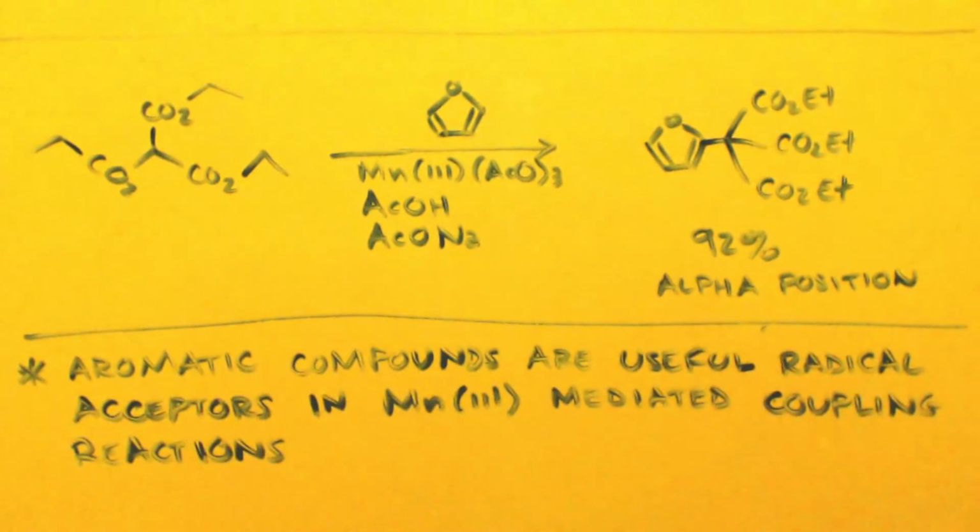So it works really well. You won't get that kind of yield with benzene and acetone, I think you'll get more like a 30 to a 40% yield. But this is why I believe that it could work. Keep in mind, benzene reacts with radicals all the time in reactions, you know what I mean? Like chlorination of benzene, you make a free radical chlorine.